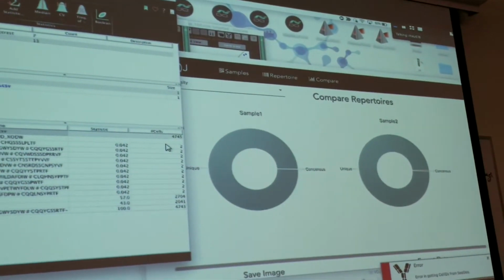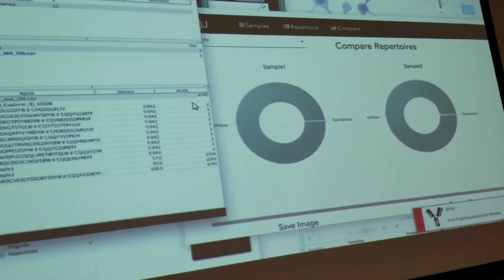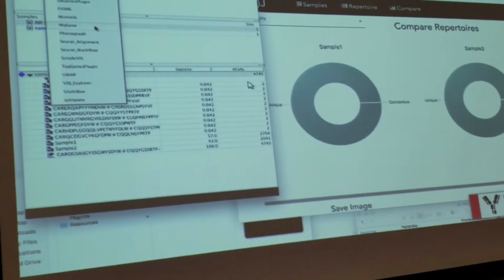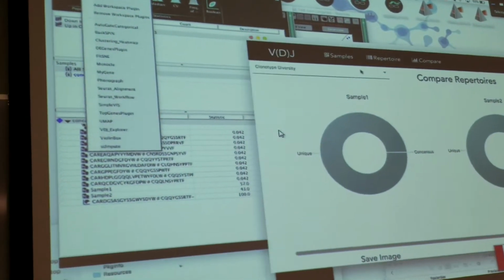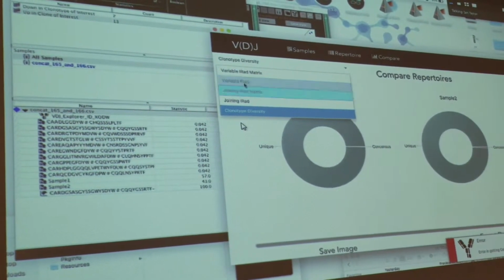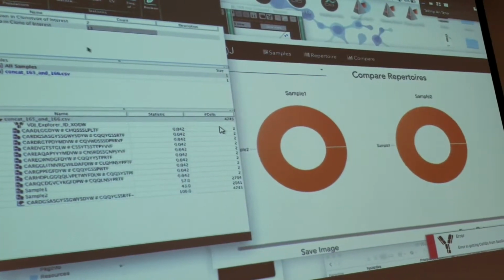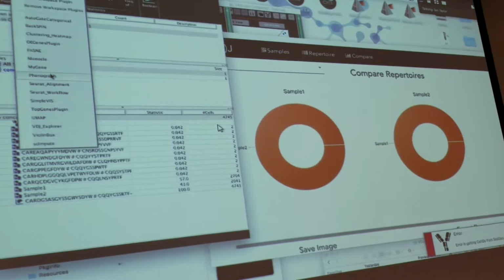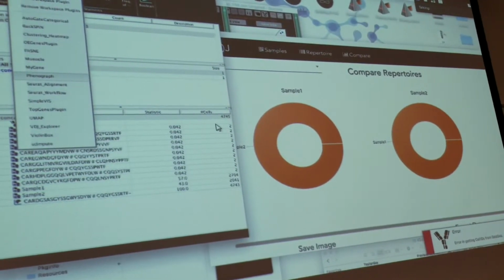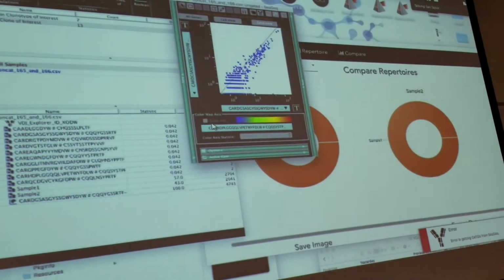I thought you were picking it because it doesn't look very heterogeneous. You had a pinwheel that had V, D, J, and light chain, that kind of thing. So those would show up if we had more populations to compare, in terms of this variable information radius. Let's see if I can do a quick graph here. Oh, we don't have any components in it. I'm sorry. How do I get this quickly?